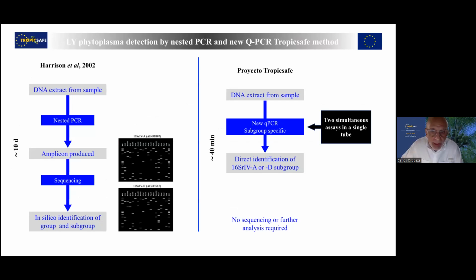So if we compare the time taken, as I said, what we are doing traditionally is a 10-day method.